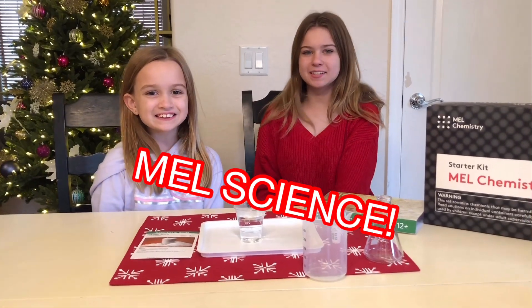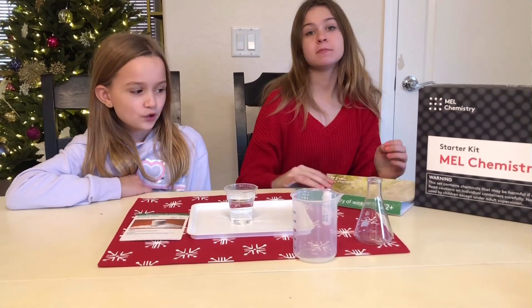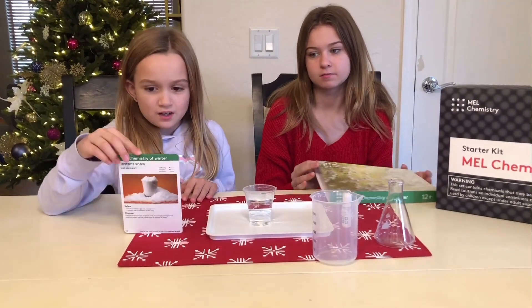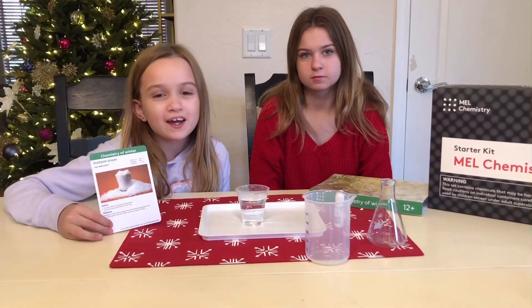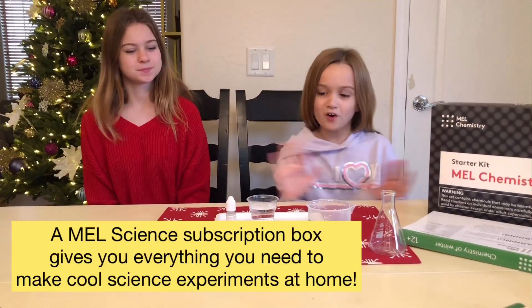Hi guys, it's Lily and Chloe and we're back in the lab with Mel Chemistry again. We have the Chemistry of Winter Science set and we're doing instant snow. We live in Arizona so we don't get any snow here, so we're gonna make our own snow. Let's get started!